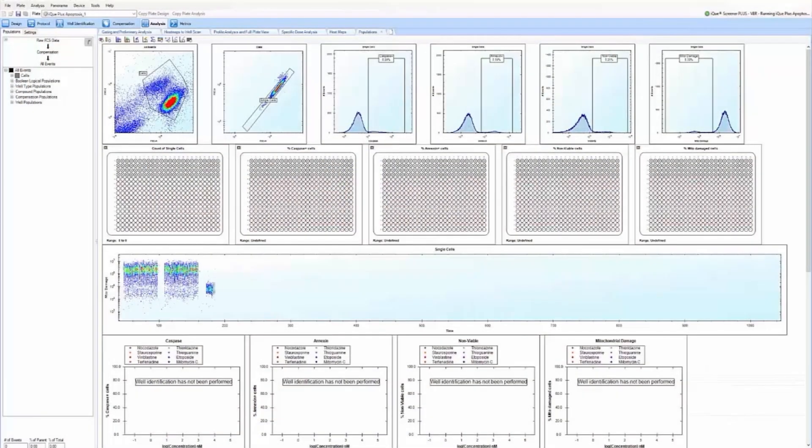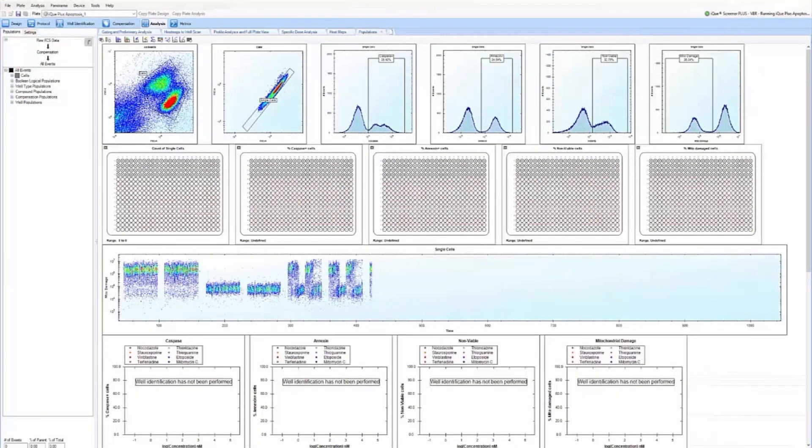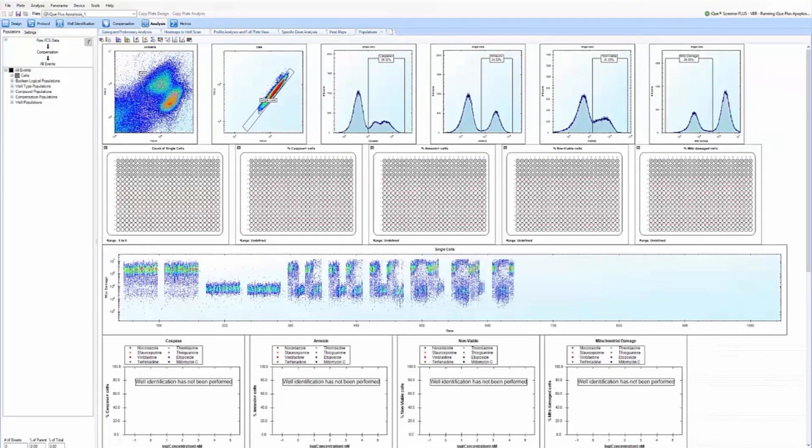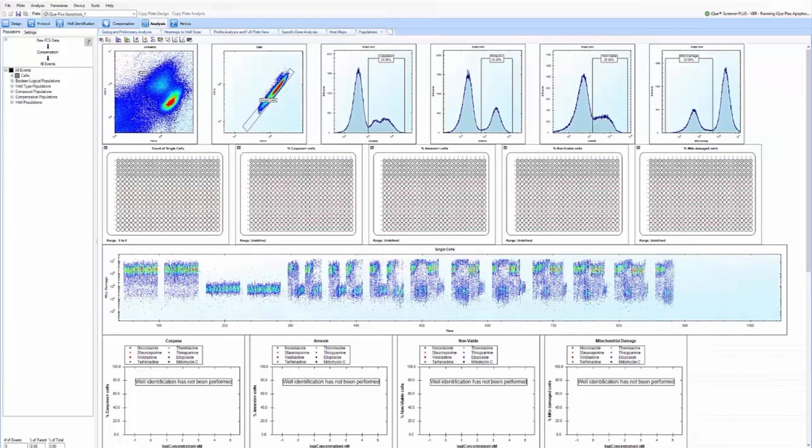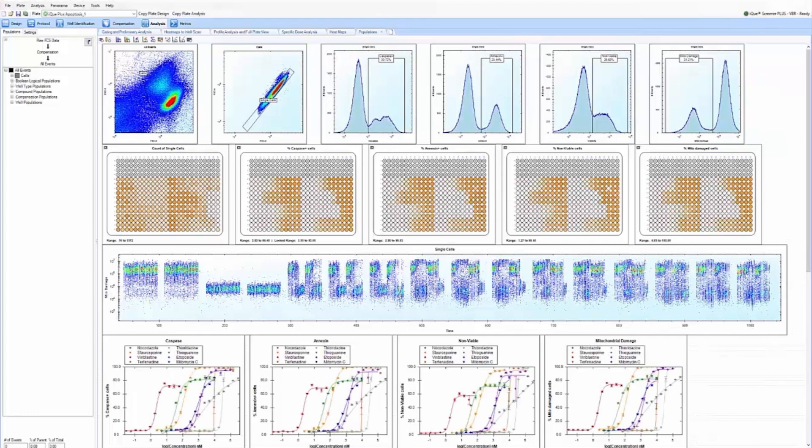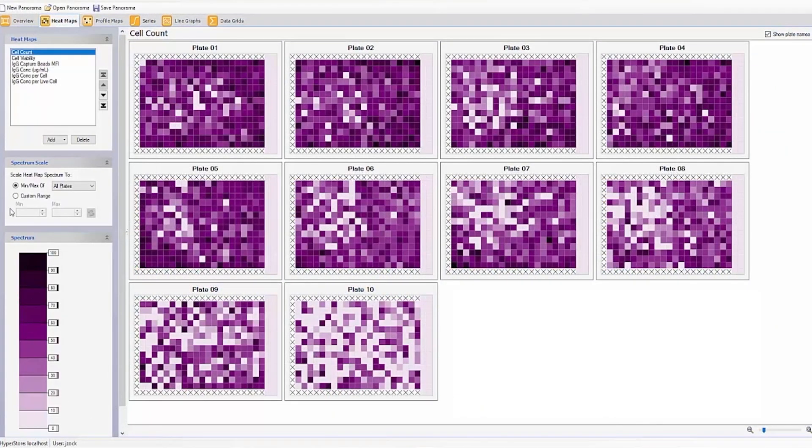This allows you to quickly and easily perform multi-parametric analyses, categorizing sample subsets and visually identifying trends to help guide the next steps of your research. Take your analysis to a whole new level by using the Panorama feature to visualize data across multiple plates simultaneously, even if acquired on separate days.